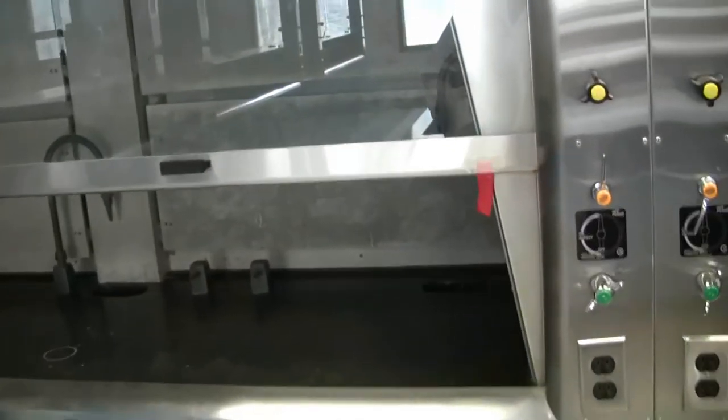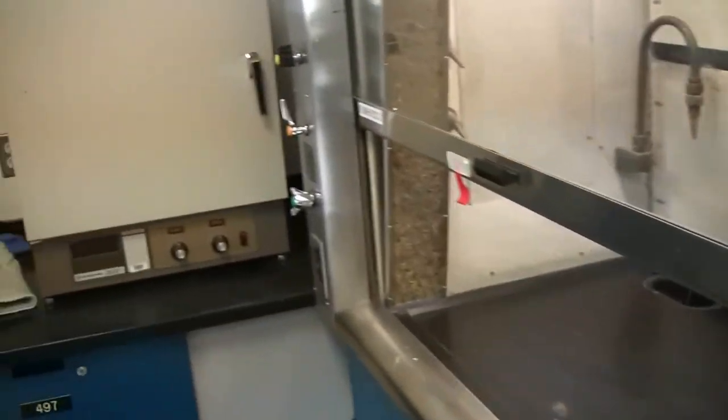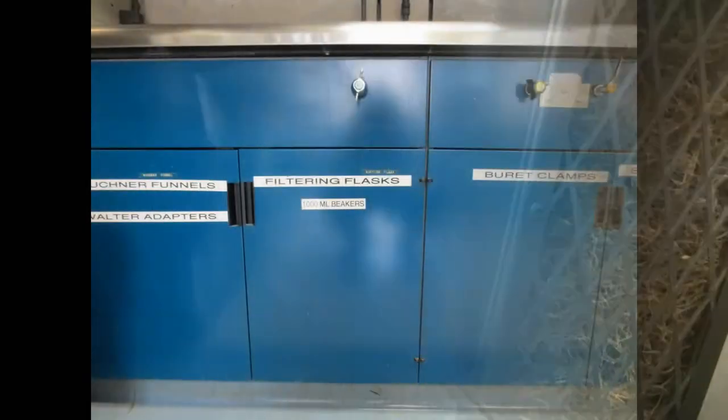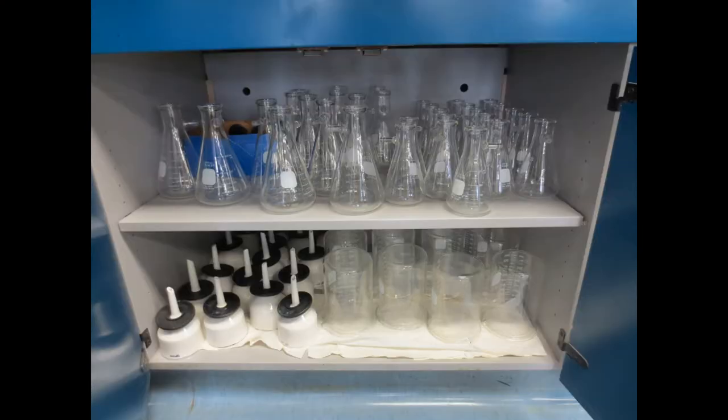There are several fume hoods along the side of the lab. A light switch, and the gas, water, and vacuum valves are also here. There is a line written here which the fume hood should not go above. Underneath these fume hoods are several items: filtering flasks, Buchner funnels, and Walter adapters.